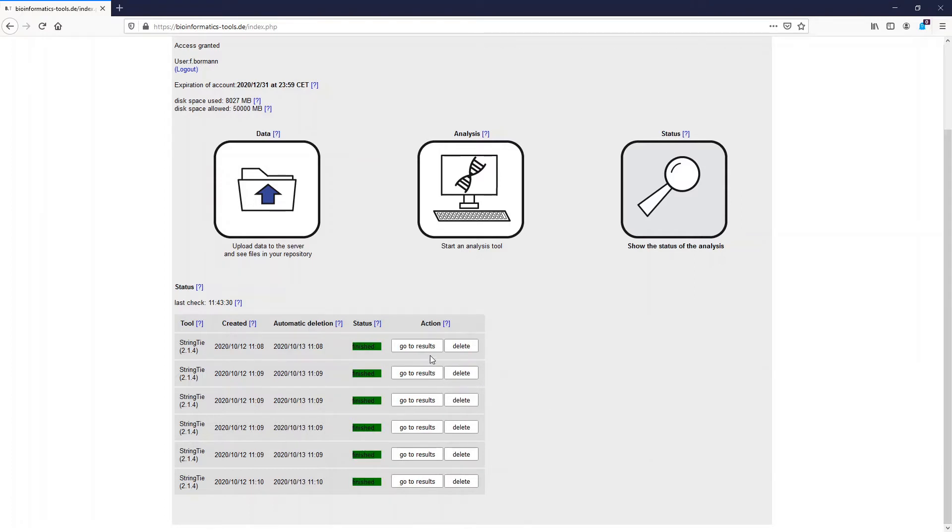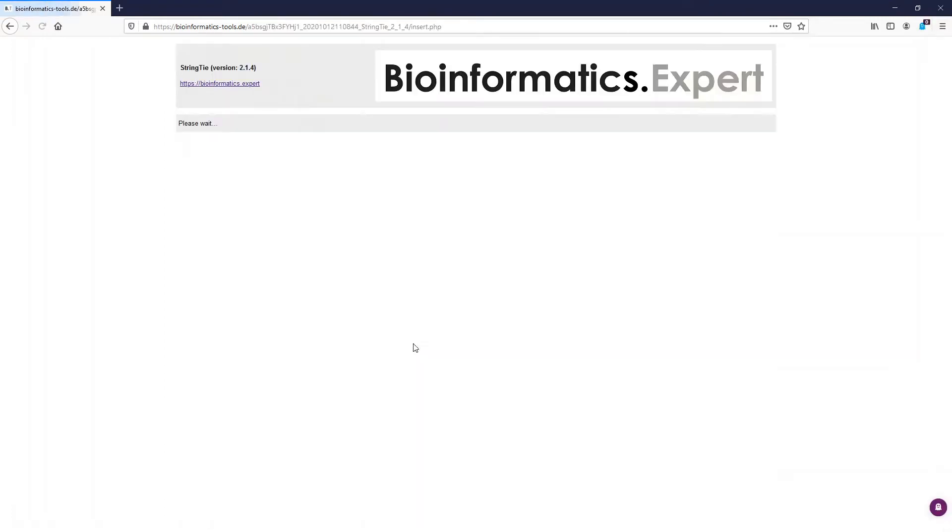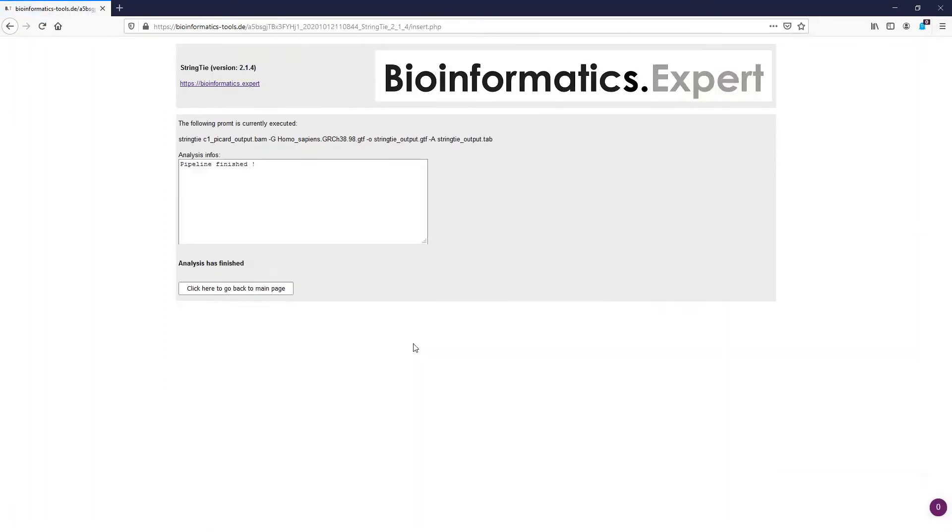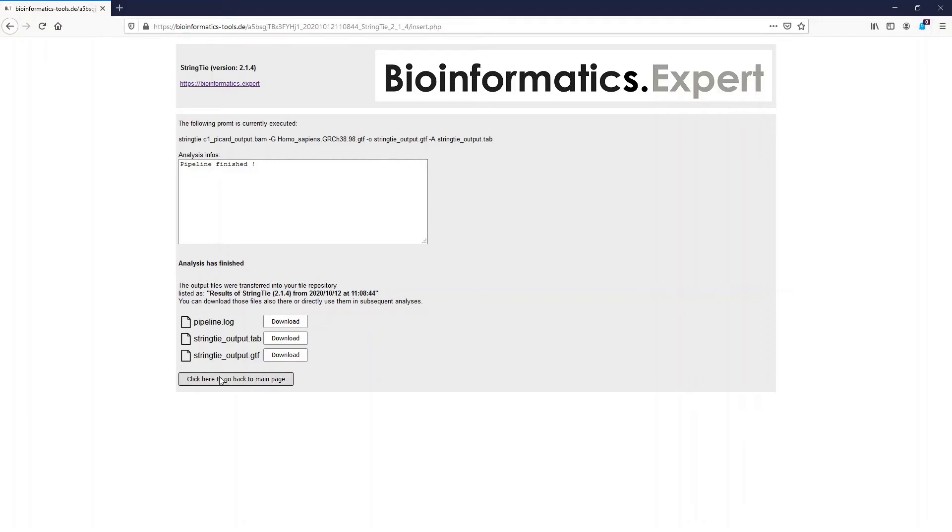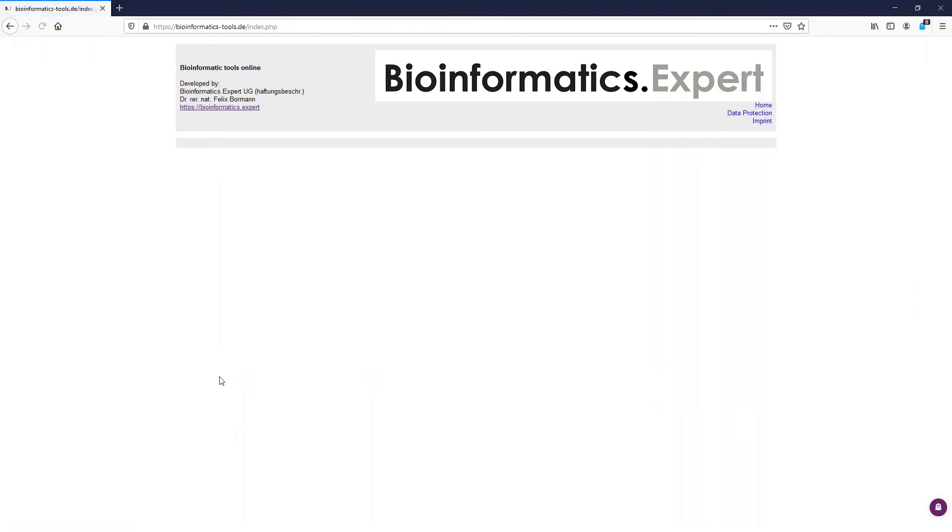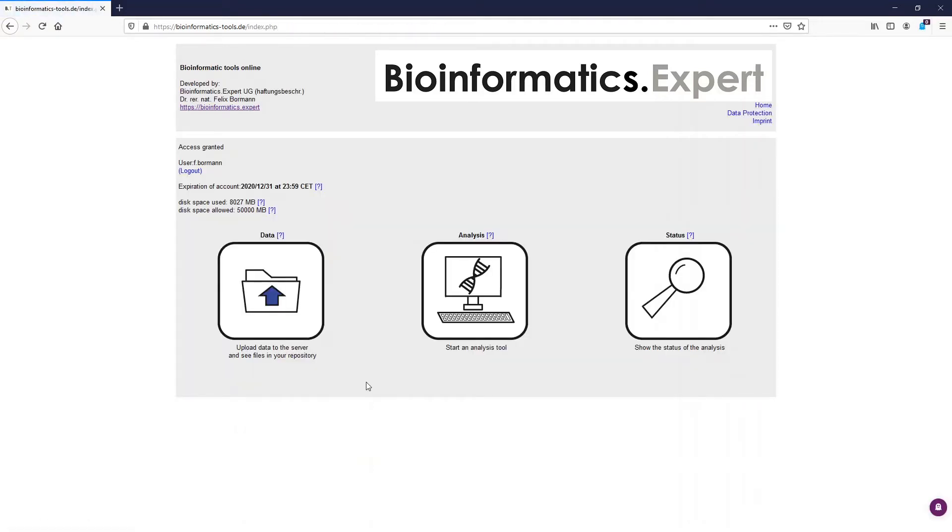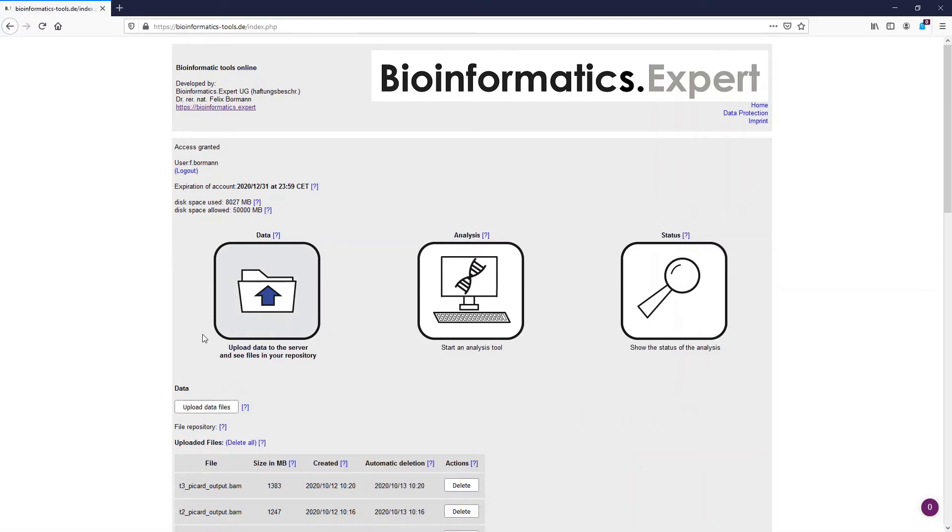When we now go to one of the analysis output pages we see the StringTie output files, a tab file and a GTF file. The tab file gives you an overview of the results. The GTF file on the other hand is a newly created reference file. It not only contains information on the already known transcripts but also on the new identified transcripts.